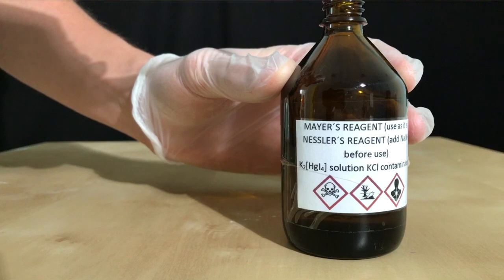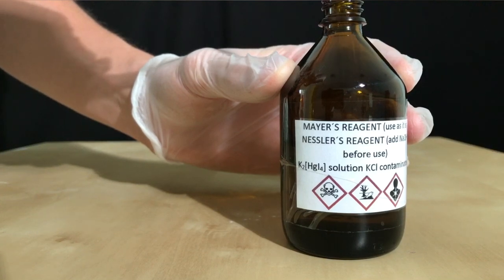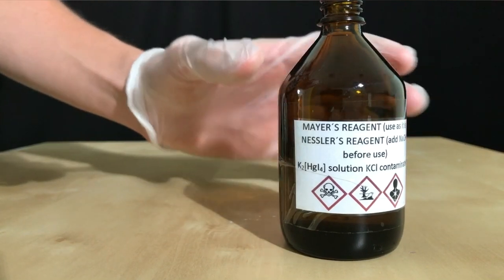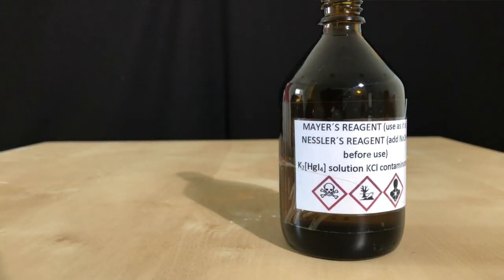I am going to show you the use as both reagents in two future videos but I am not going to pack it into today's video because I kind of failed with the test. So yeah, stay tuned.